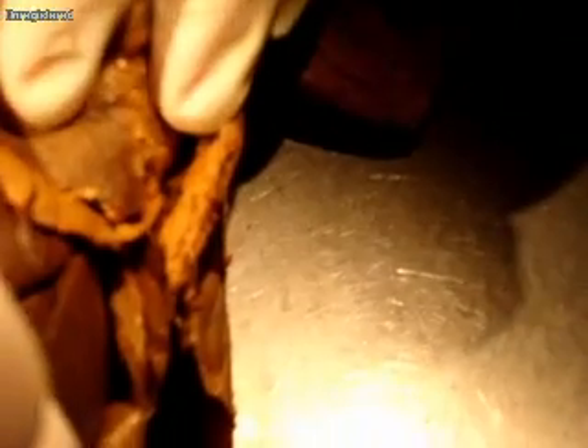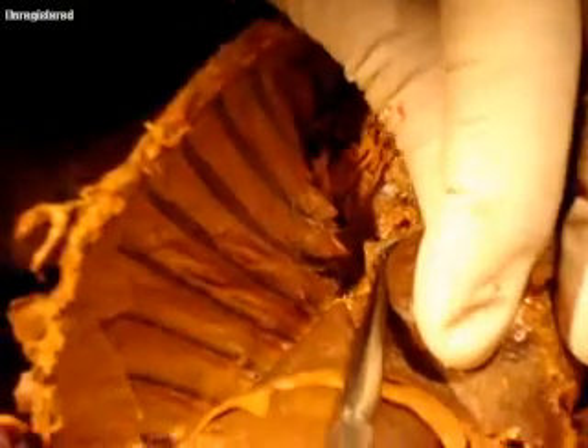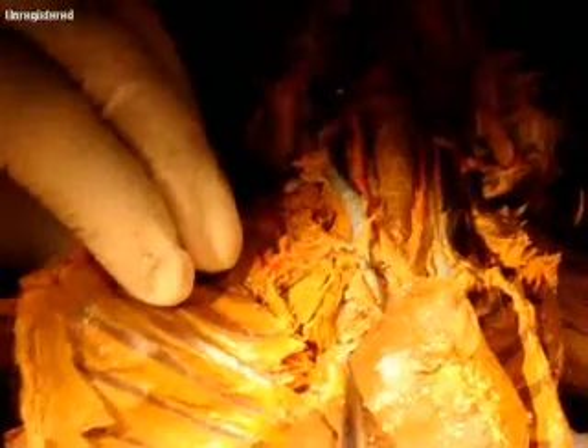Now, if you fold the lungs up and look underneath the lungs, you're going to see over on the side — you see what I've got the loop under? That is the azygous vein. See the azygous vein right there?